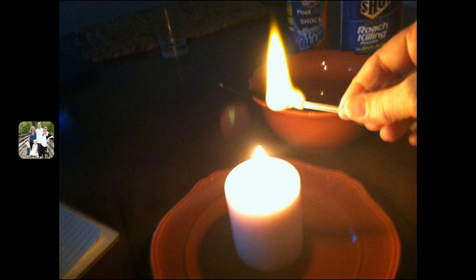For example, if you look at this flame, the outer edges of the flame have a much more pronounced yellow color. This chemical ignited is sodium chloride or table salt. This chemical produced one of my favorite colors. See the beautiful green hue? This chemical is boric acid, or powdered roach killer.